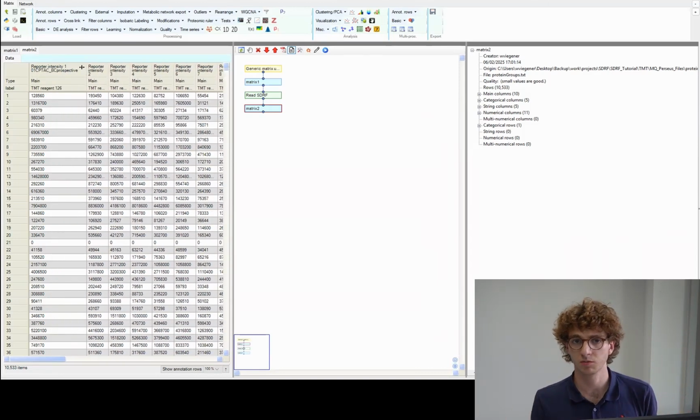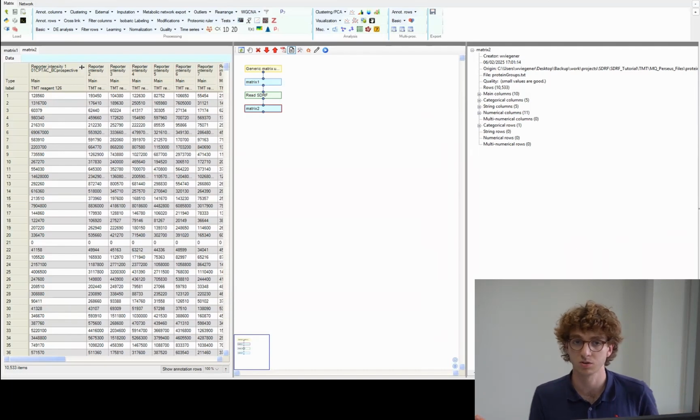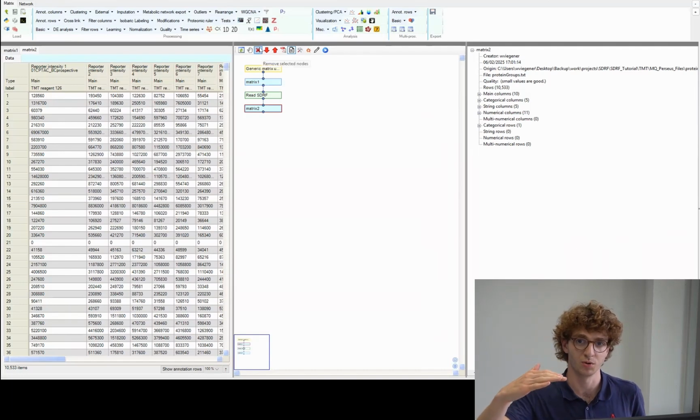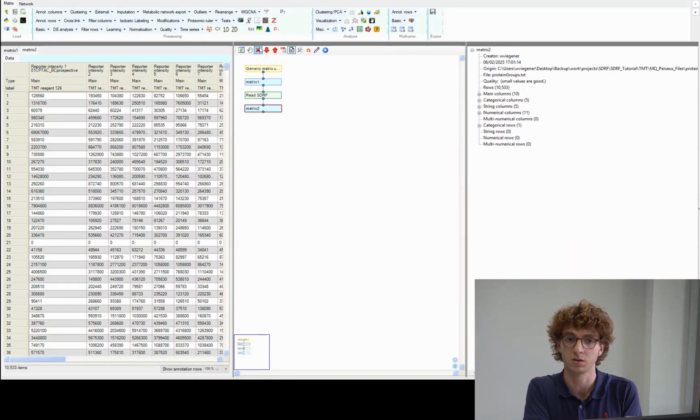And with all that information, you can then later also automatically have your annotations. And this is really important also for users themselves. If you want to do now statistical analysis, those annotation rows are automatically saved. So it's not only beneficial for the community to have information about all your raw files, but also for every user themselves to directly be able to edit the information.